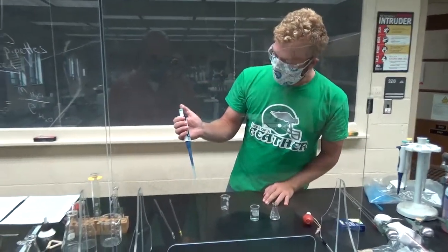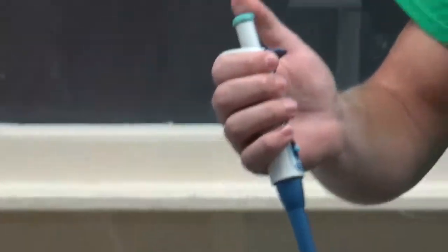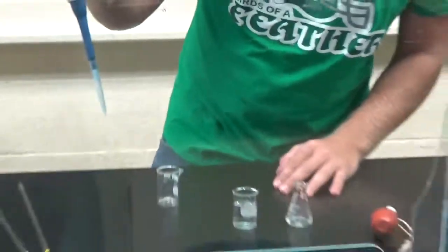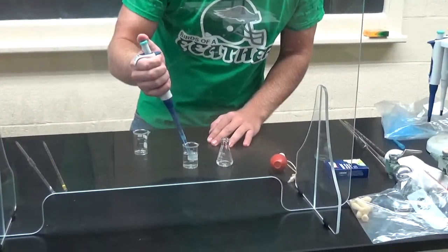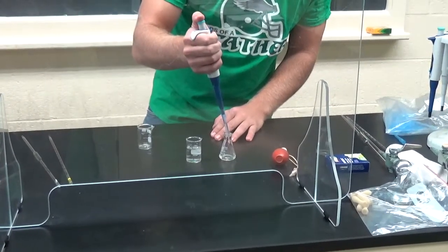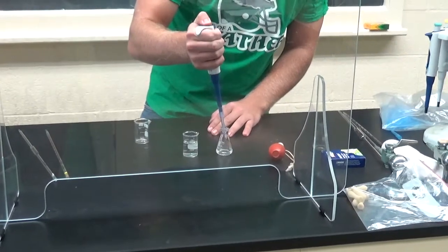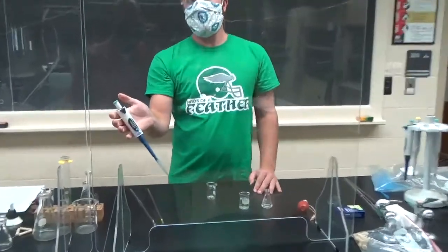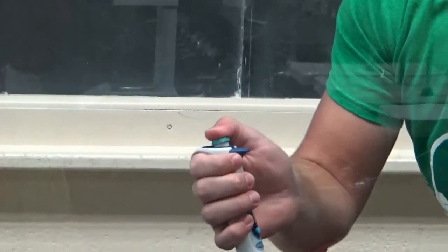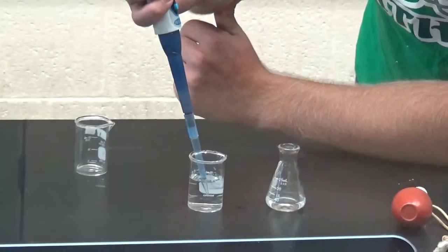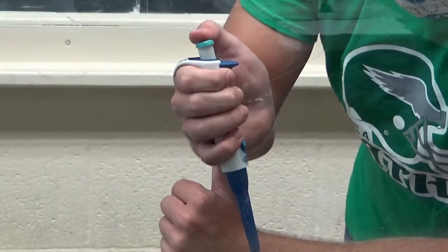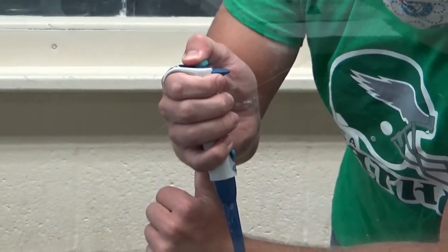When you want to draw something up, there's like two stopping points on an automatic pipette. When you want to draw something up, you only go to the first stopping point. You go down, you press down to the first stopping point, you draw up the amount of the solution or water that you would like, and then you pull out. Then you go down to the second stopping point past the first one. Let me zoom in on pressing down completely. You go down to the first stopping point, draw up the amount of solution, and then you go all the way down to the second stopping point. That pushes all the liquid out.